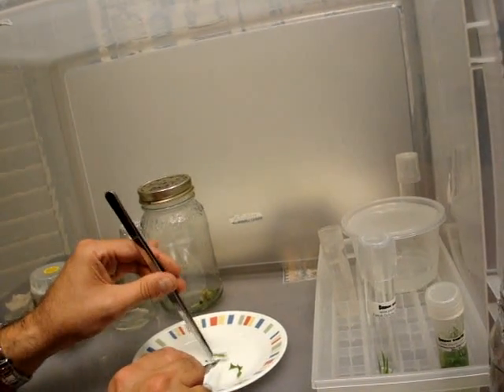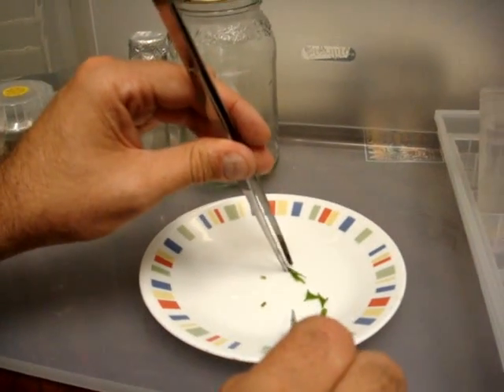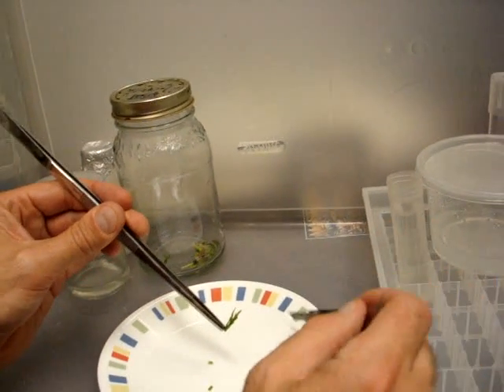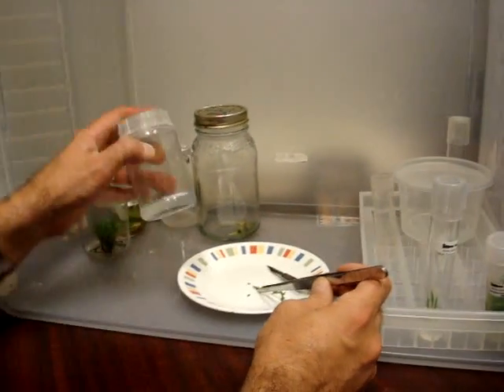And lastly, I'm going to take my node. Gabby, if you're interested, we'll take this entire thing. It could be two pieces, but I'm going to put this in one jar, and it should grow faster.